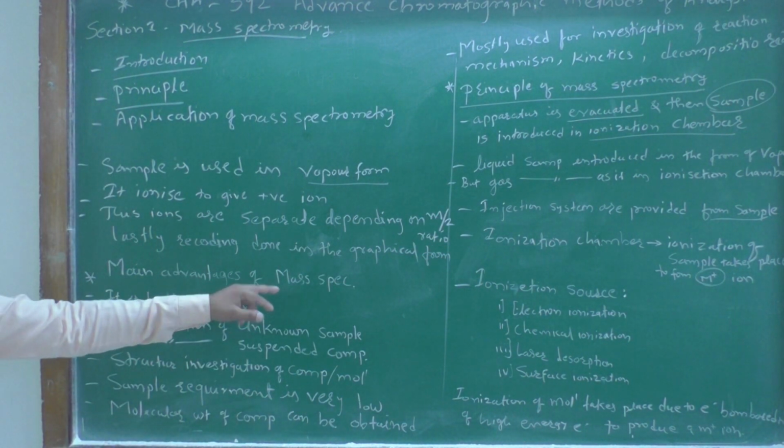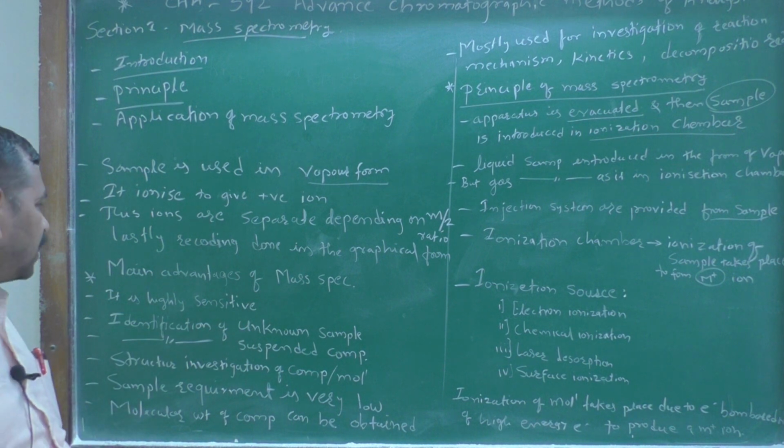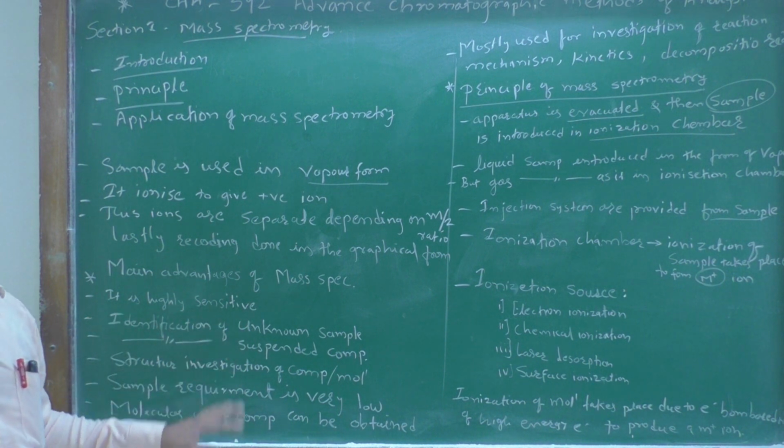Here are the main advantages of mass spectrometry. First, it is a highly sensitive technique.